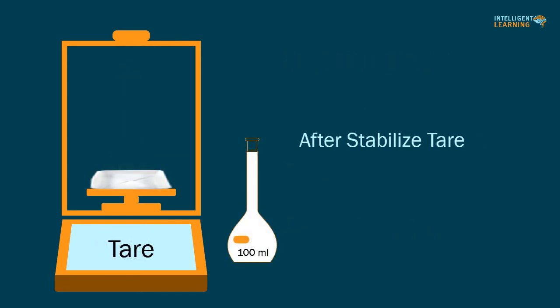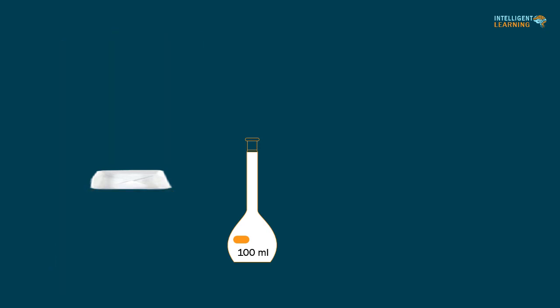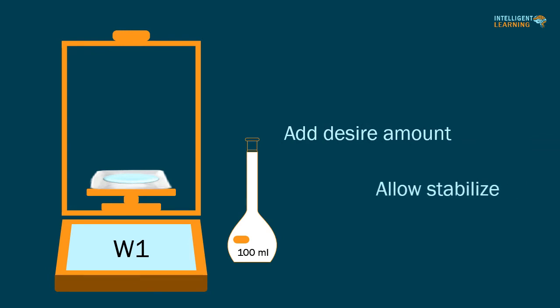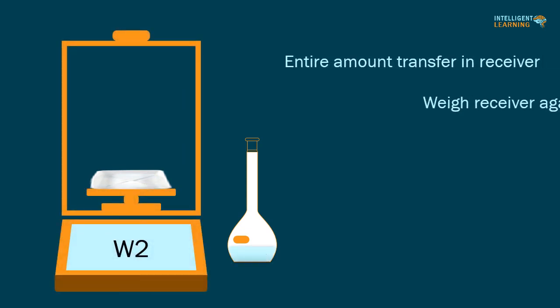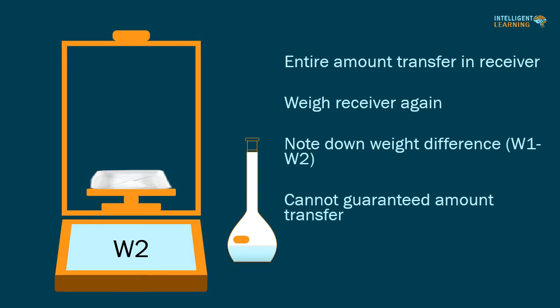This practice guarantees that the entire amount is transferred. Quantitatively transfer the material to an appropriate vessel. Alternatively, place the receiver on the balance, tare it, add the desired amount, allow the display to stabilize, record the weight, and transfer the entire amount to an appropriate vessel. Weigh the receiver again and note the weight difference for sample transfer. However, this practice cannot guarantee that the entire amount has been transferred.